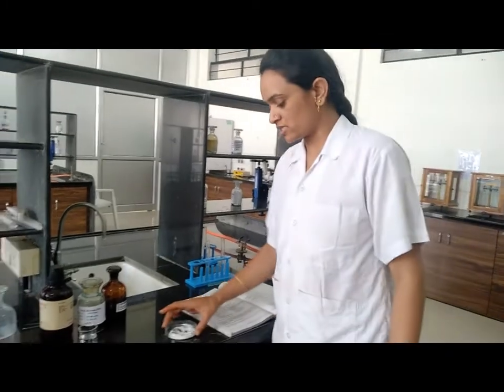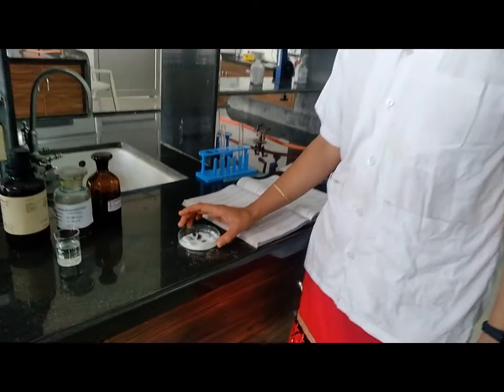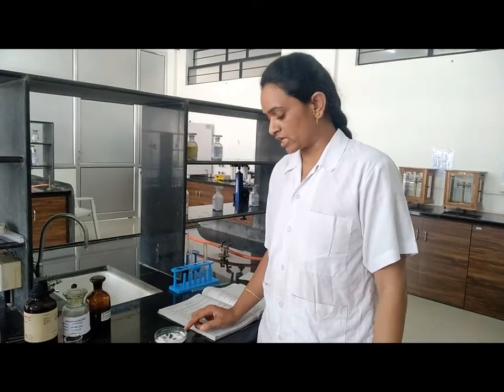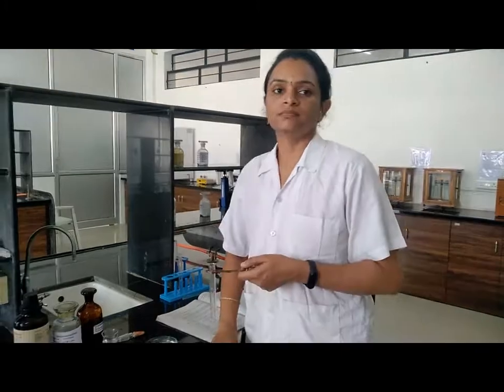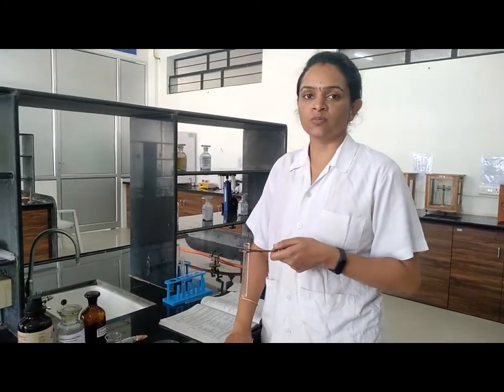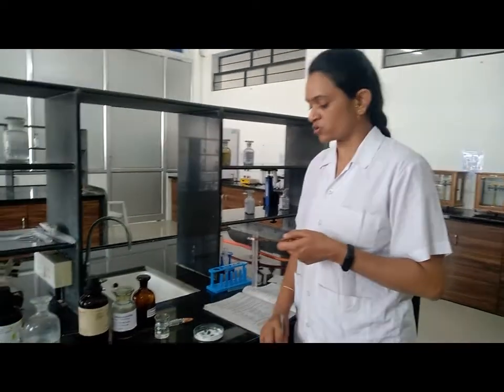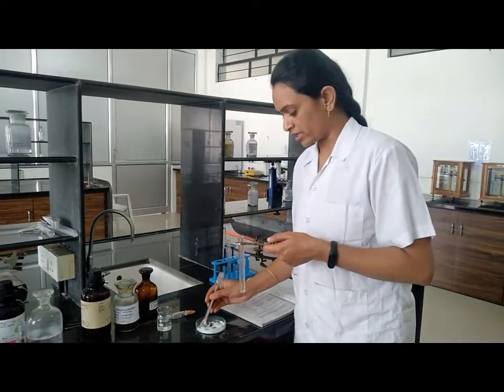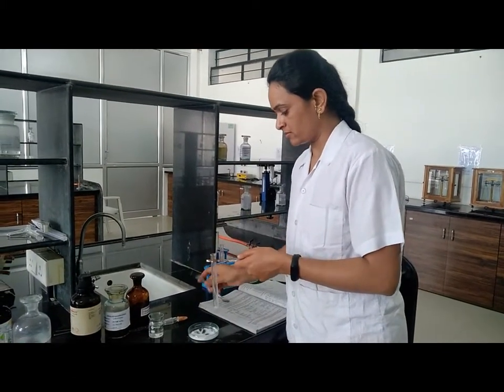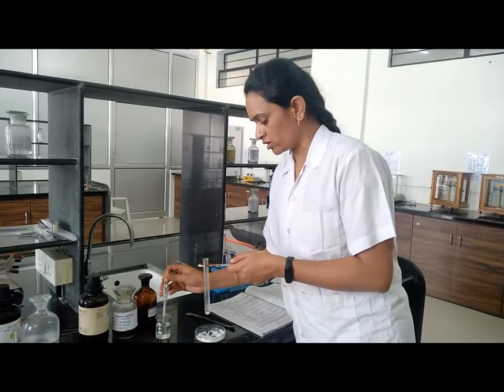Let's start with procedure for description. This is the sample of aspirin or acetyl salicylic acid. It has color, colorless or white crystalline powder. It is odorless. Now we are going to deal with solubility. Second procedure for solubility. We have to perform solubility in different solvent. First we have to take solubility in water. Take approximately 1 milligram of sample and then add water.